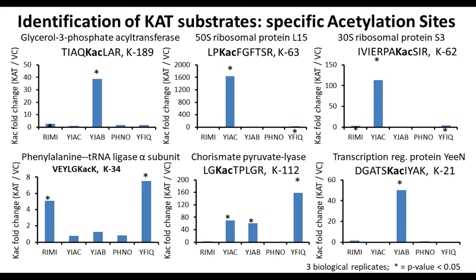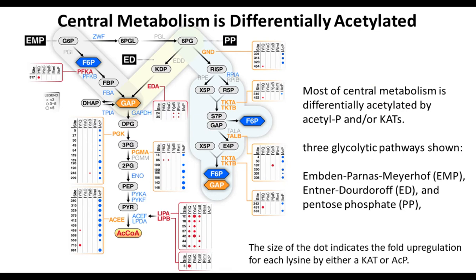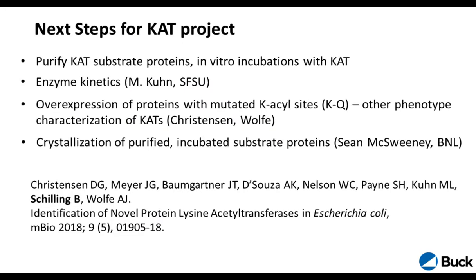So this was actually quite interesting, and again, I wanted to emphasize that this project was really only possible by having a good, efficient, and reproducible enrichment strategy, because we were also working in a label-free environment, so everything has to be really reproducible. It was interesting to see biologically that much of the central metabolism was affected here, and the little dots show us, either in red or in blue in the tables, which of the acetyltransferases had specificity for these sites. So this was biologically rather interesting for our collaborator.